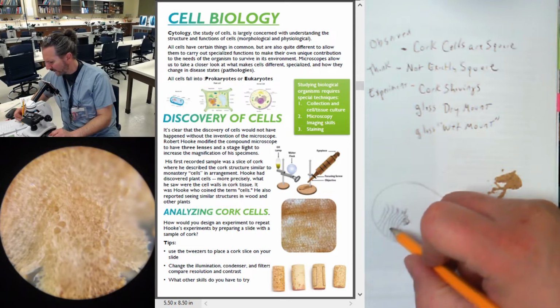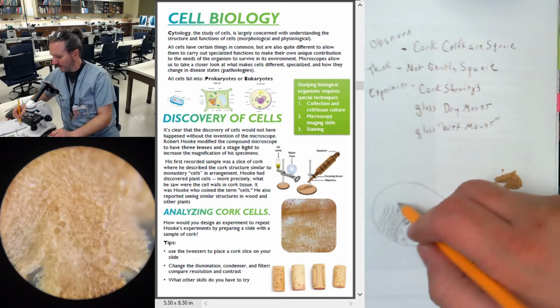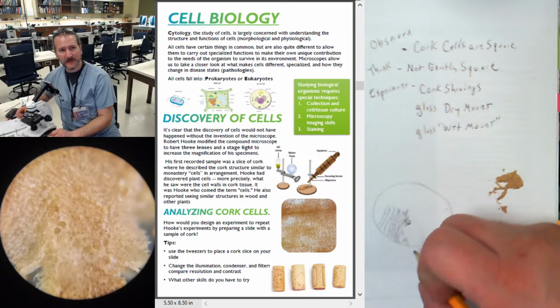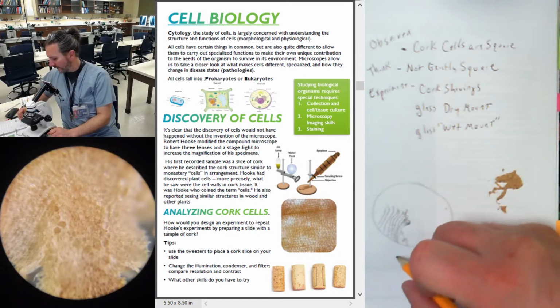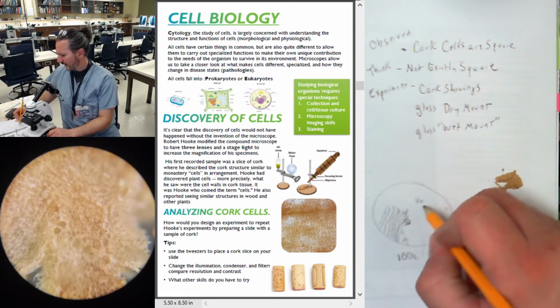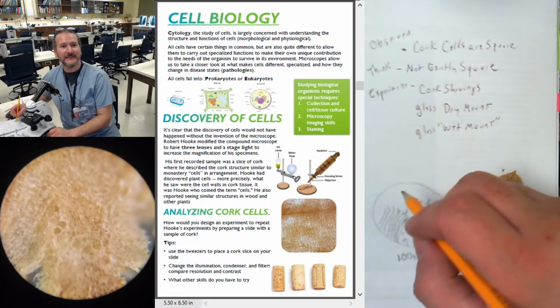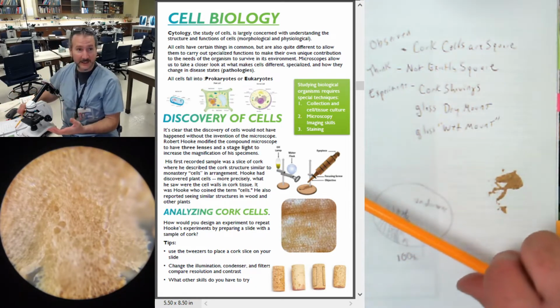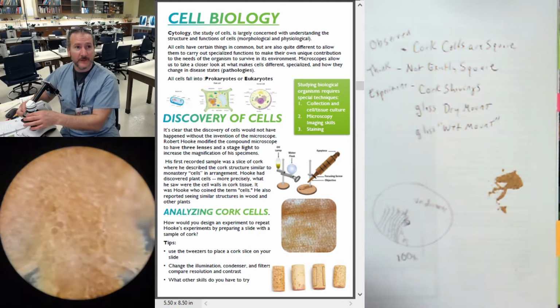So I think it was kind of right. I'm only really drawing that part over here, but then I have a couple of these odd ones here in the middle, and this was at 100 times, and I undrawn. I didn't draw that side. Okay? But it's kind of cool what I saw here. What I'm going to do now, flip to my scanning again.